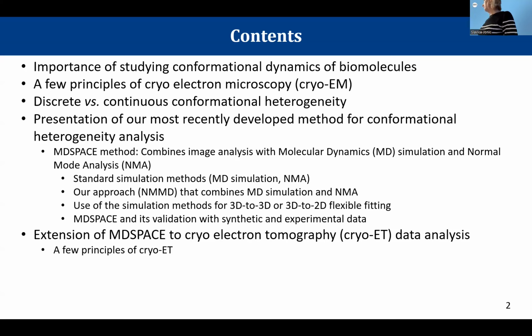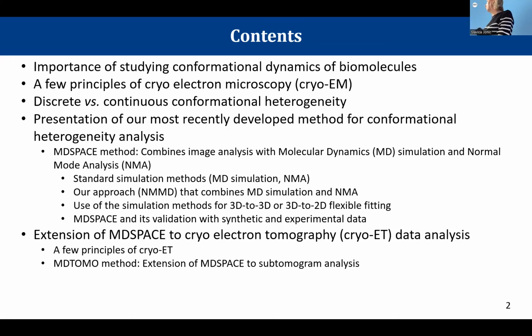In this context, I will present an extension of MD-SPACE to subtomogram analysis. I will give you a few principles of cryo-electron tomography, and then present this MD-Tomo method that works similarly to MD-SPACE. So it combines MD simulation, normal mode analysis, and data analysis, but to analyze 3D subtomogram data in the same context of conformational heterogeneity analysis.